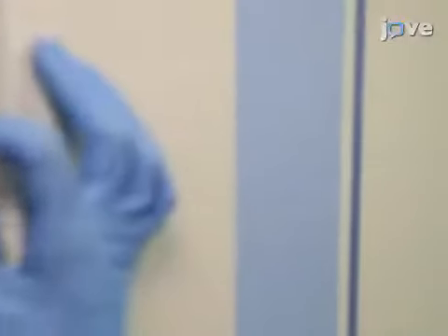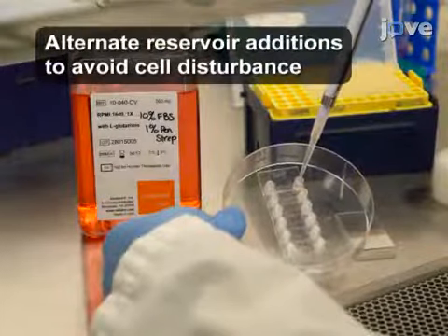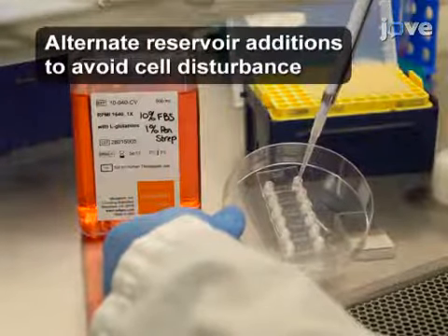Settle the cells in a 37 degrees Celsius incubator with 5% carbon dioxide for 5 minutes. Then add 200 microliters of complete culture medium into both reservoirs of each chamber and return the plate to the incubator for overnight culture.